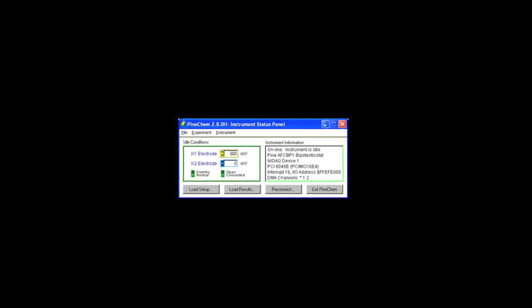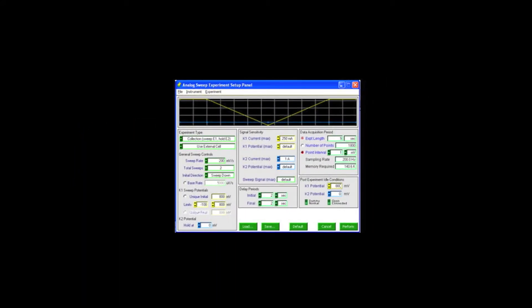Choose the experiment menu option and select analog sweep voltammetry. Adjust the settings to match those shown. Click on perform to start the measurement. The cyclic voltammogram should be relatively flat with no significant peaks. If the plot is not fairly straight, the electrode should be polished again and the background scan should be repeated. If the problem is not solved, the cell or electrolyte solution may be the problem and should be cleaned or replaced.